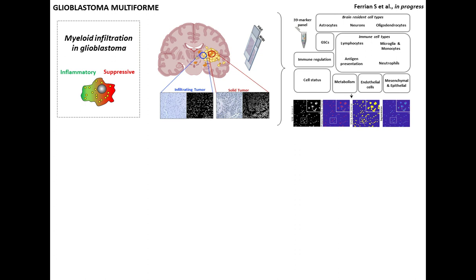To this end, we are using novel experimental and computational approaches that allow for highly multiplexed, spatially resolved, comprehensive single-cell network analysis of cells in brain tissue. Using our MIBI technology, we will be able to unveil the role of glioma infiltrating macrophages in disease pathogenesis. More specifically, we hope to elucidate which cell phenotypes can predict patient survival and response to treatment, how they behave, and where they are located within the brain microenvironment. These, hopefully, will give us insight for future immunotherapy strategy in glioblastoma.